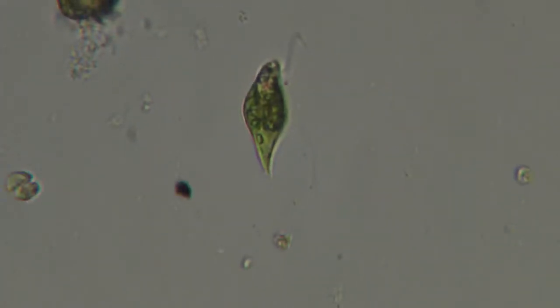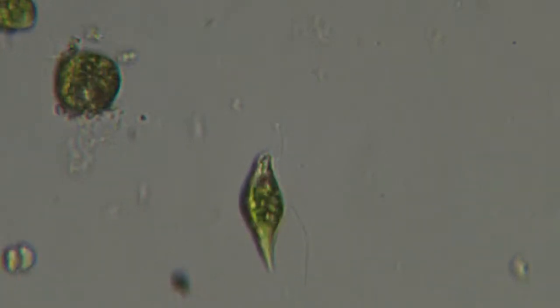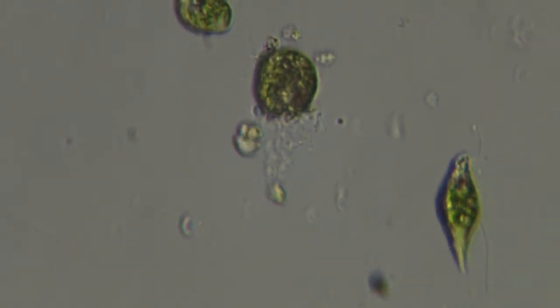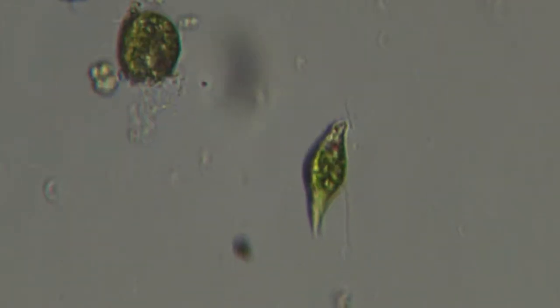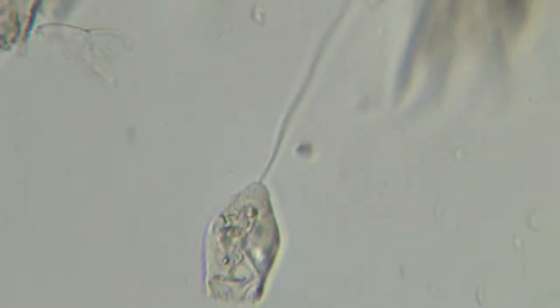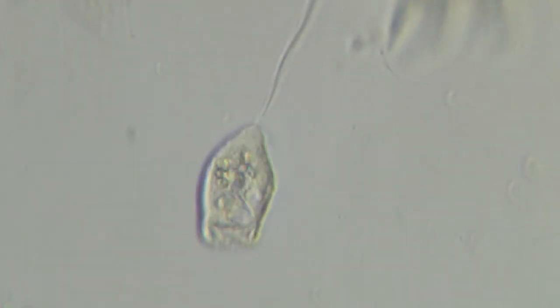And nice Euglena taking a break. Flagellum is slow. Actually, a few Euglena here. Some are balled up, probably not too happy. Well, this one is still going to town. And it's leaving. Like South Park. And it's gone. Let's go back to the Vorticella. Love these guys.